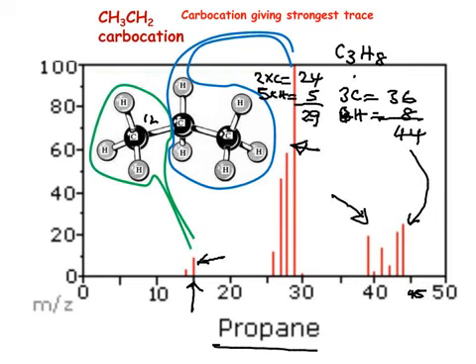And these could be put down to the fact that hydrogens are getting knocked off, so that the mass is falling by 1 for each hydrogen that comes off, perhaps. Similarly here, once we get the ethyl with 29, maybe the ethyl begins to lose hydrogens as well, which would explain some of these.